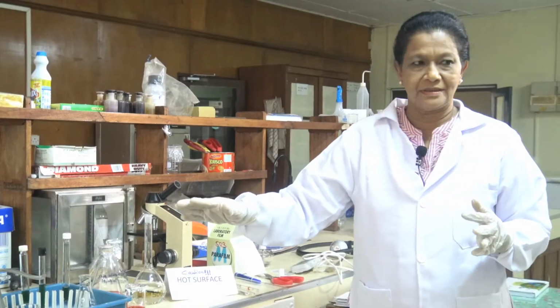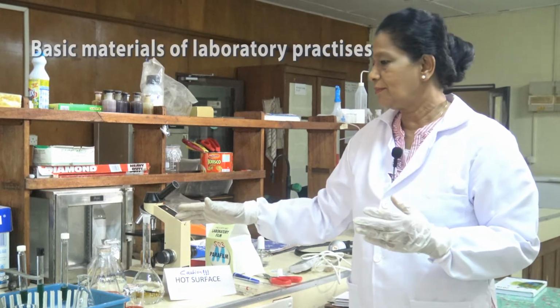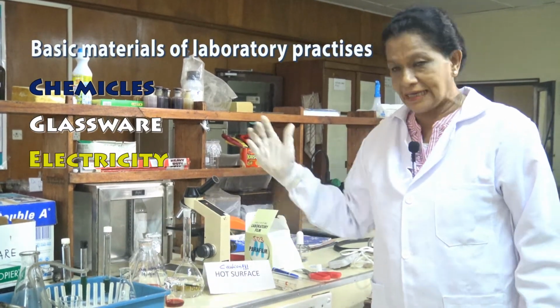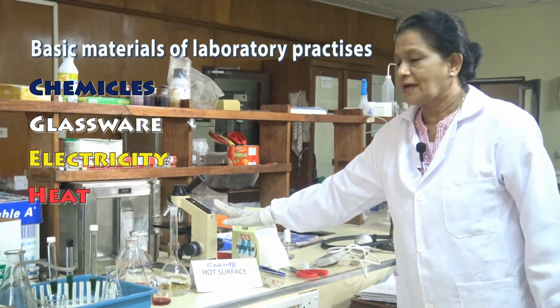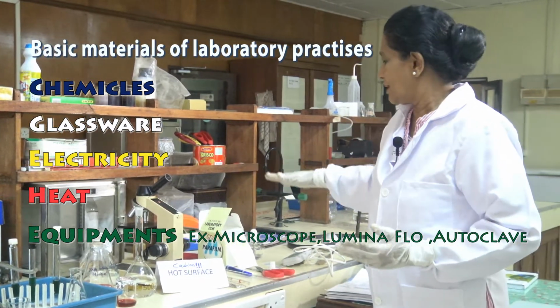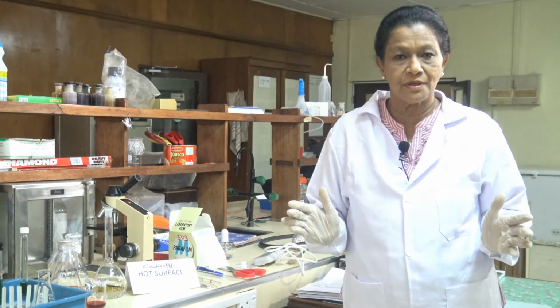So, these are the basic materials that are used in many laboratory practices: chemicals, glassware, electricity, heat, equipments like microscope, laminar flow, autoclave and ovens, and burner or flame. And also, if you are working in a microbiology lab, you need microbial cultures.